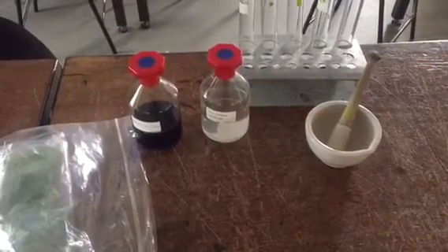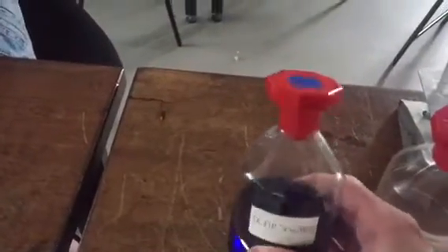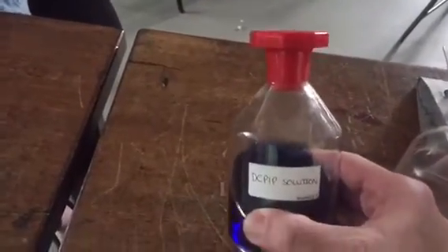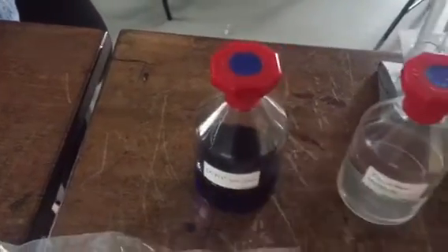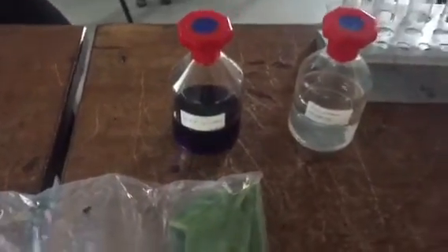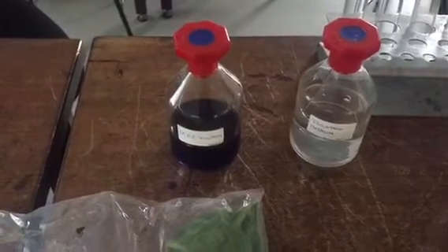To do this we are going to take some plant material - we have some spinach leaves here and we are going to isolate the chloroplasts from those. We are using a chemical called DCPIP, which we have used before in a core practical for testing for vitamin C. DCPIP is an electron acceptor - it accepts electrons and goes from blue to colourless as it is reduced.